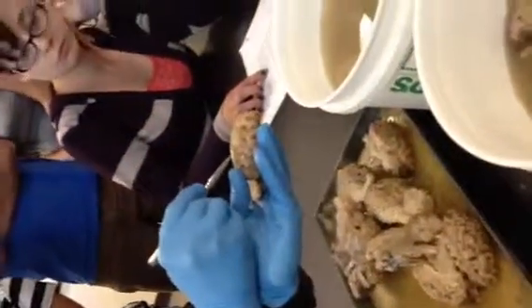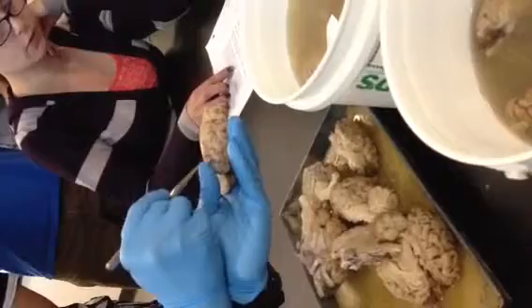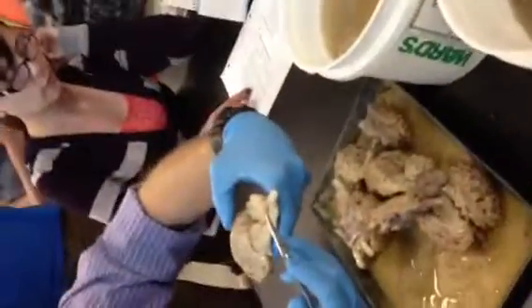Okay? Circle, midbrain, pons, and medulla, then the cord. There's the central canal of the cord. See that? Central canal of the cord. See that stripe? That dark stripe? Okay. Did you see that?